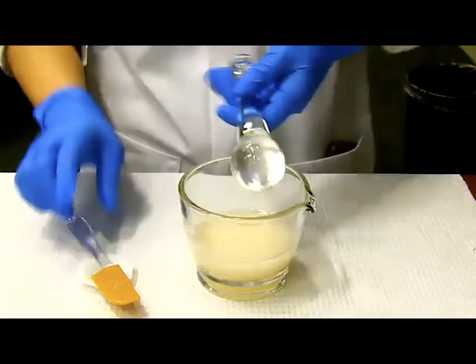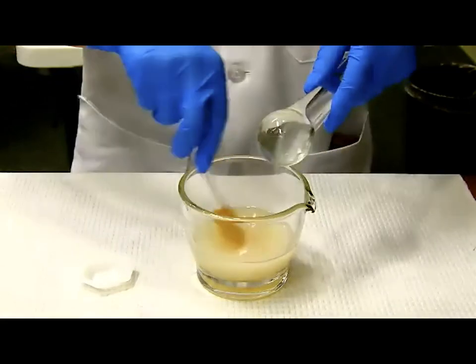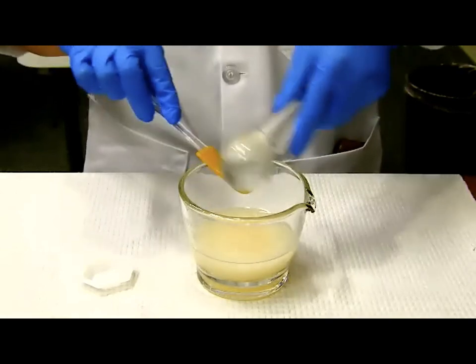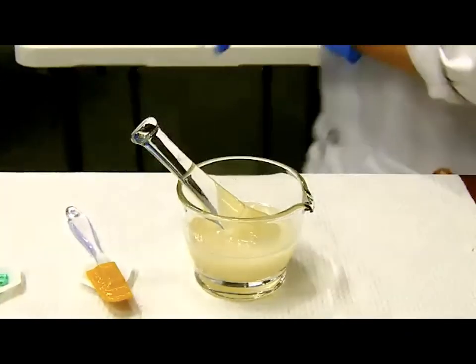All right, and one more time, I want to clean my pestle, especially my rubber spatula. I don't want to lose any drug. Okay, we are all set. All right, so here's the thing. Now we are ready to transfer.